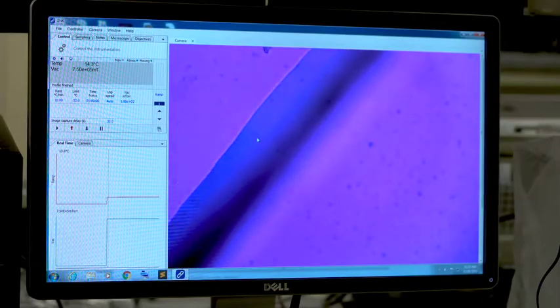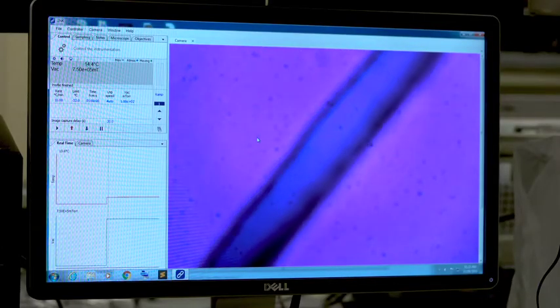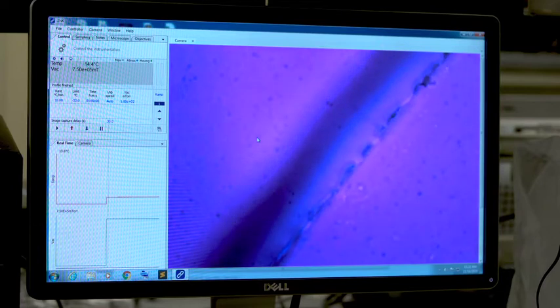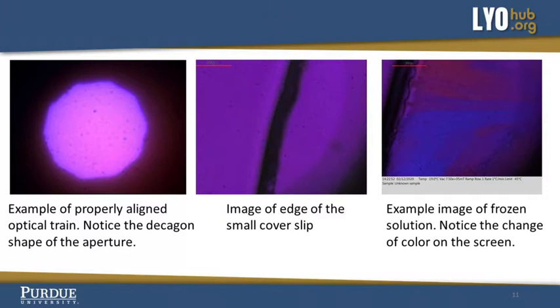Bring the sample into focus. This is most easily accomplished by navigating to the edge of the small cover slip. Here you can see an example of a properly aligned optical train as well as an image of the edge of the small cover slip. The last image shows an example of a frozen solution. Notice the change of color on the screen.